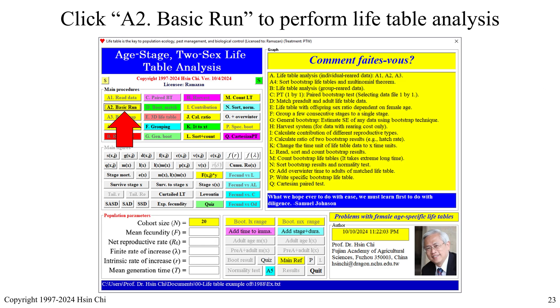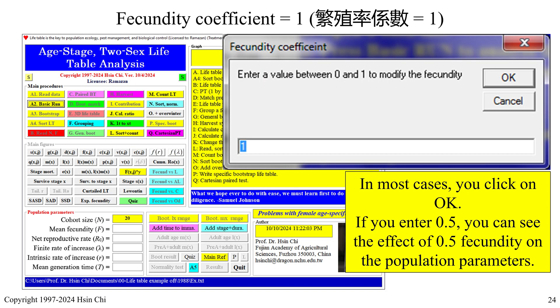Next, click on A2 Basic Run to perform the life table analysis. You will see a Fecundity Coefficient message. If you don't need to lower the fecundity, click OK to use 1. If you enter 0.5, you will see the effect of 0.5 fecundity on the population parameters.